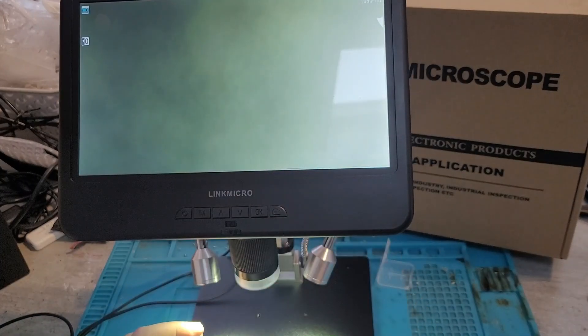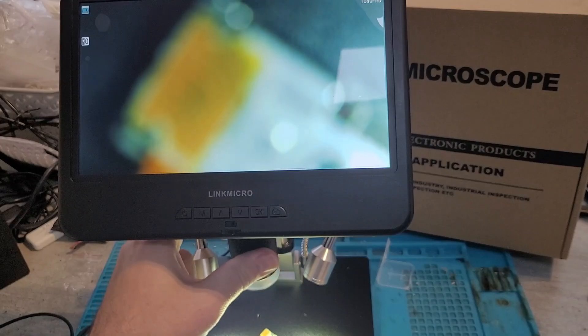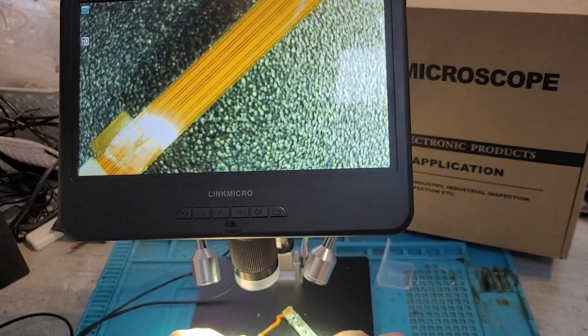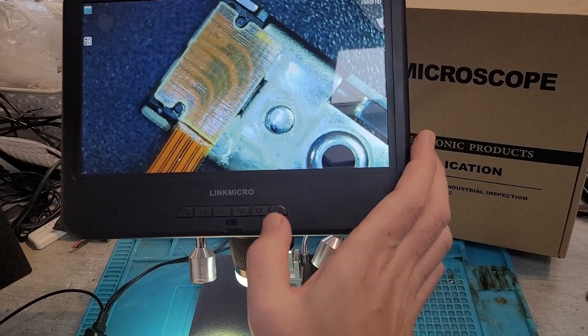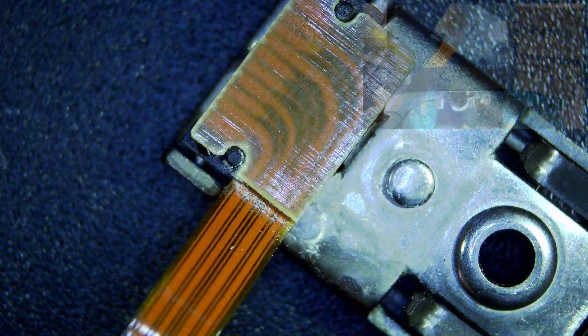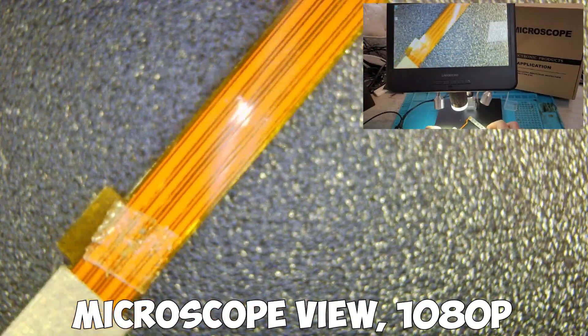I've got a little switch side panel to test, so you just adjust the adjuster, focus it in, and you can see a really clear, nice bright screen. Pressing the OK button starts the recording, and you'll see a little red flashing dot in the corner. This is 1080p footage — slowly moving it round, there's no lag and no delay. It works really well.